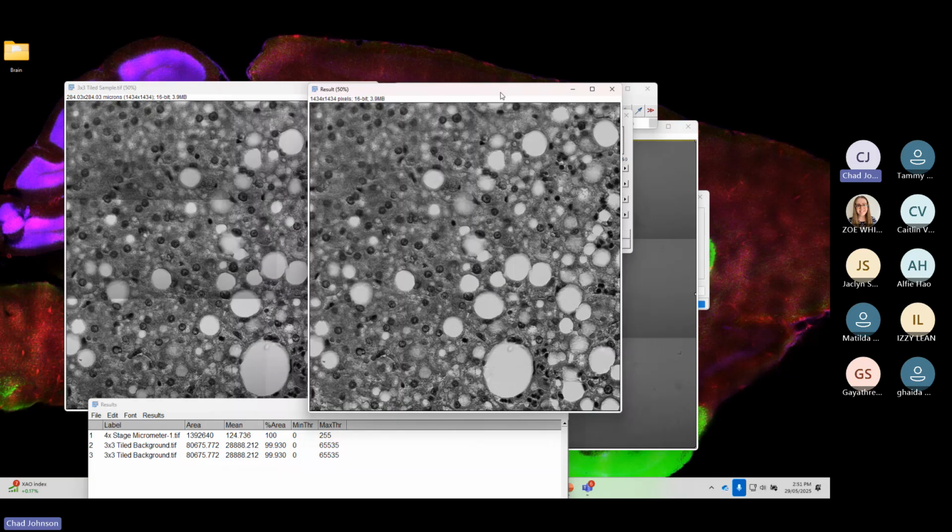Nice and easy. Now, if I do train you on the confocal and you are doing this, I will show you the functionality within Zen itself to do this when you're doing your stitching. It does have an input for putting in a background image and removing the stitching artifacts anyway. However, you can do that using ImageJ anyway, and just do it that way.